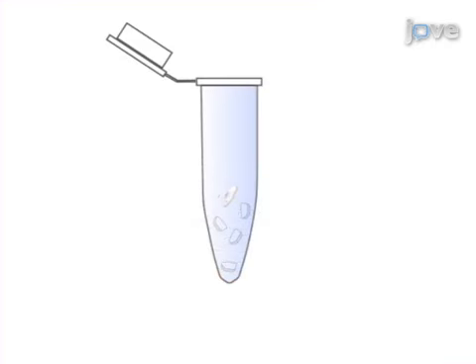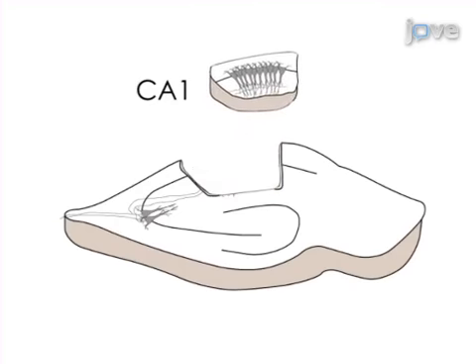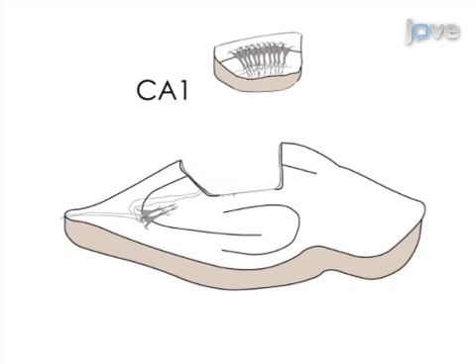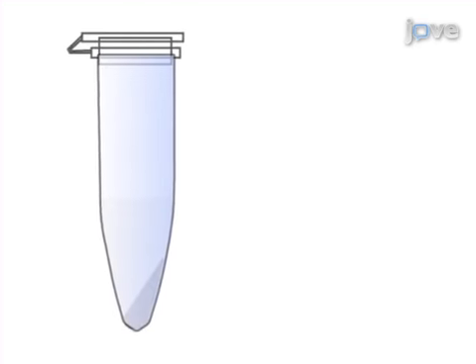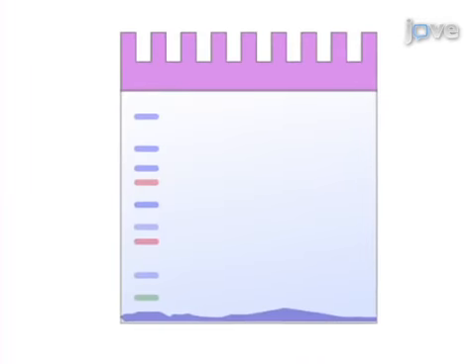Next, the potentiated and control slices are snap-frozen, and the stimulated CA1 regions are dissected in order to isolate the nuclear enriched fraction for further immunoblot analysis. Results based on Western blotting analysis show differences in nuclear phosphoprotein levels between the potentiated and control slices 30 minutes after the induction of LTP.